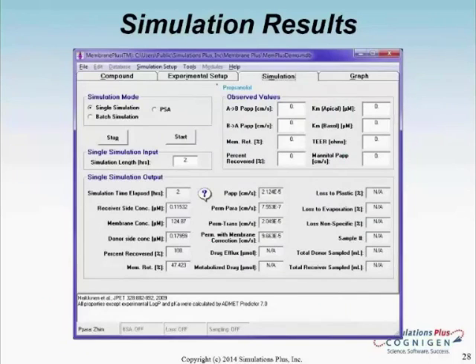The next step, once you have your compound properties and specified the experimental setup, of course, comes down to running the simulation and getting predictions for some of these outcomes. The simulation tab includes outputs for some of the processes that you've incorporated. Of course, we give you output for the permeability and paracellular permeability as well as the transcellular permeability contribution to the overall measured permeability.